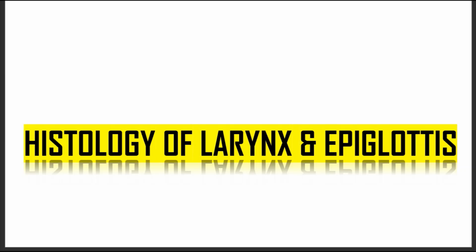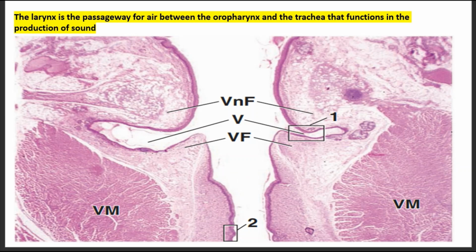Let's look at the histology of the larynx and the epiglottis. Now, the larynx is the passageway for air between the oropharynx and the trachea, and functions in the production of sounds. So this here is coming from the oropharynx, air is coming like this, and then this part is what we call the larynx.